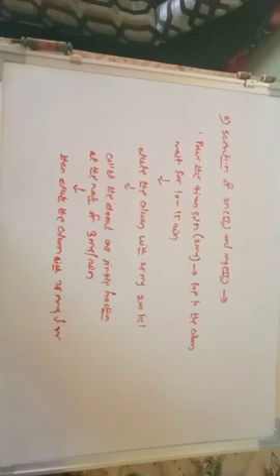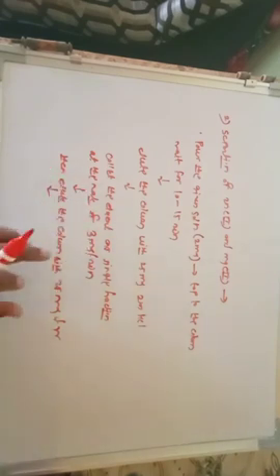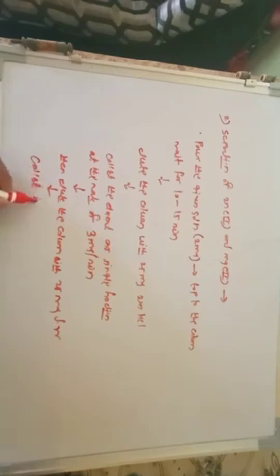Collect in the same conical flask. So you have already collected the fraction at 3 ml per minute, and after elution with water, you have to collect all the fractions in the same conical flask.